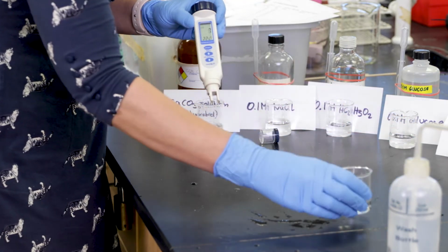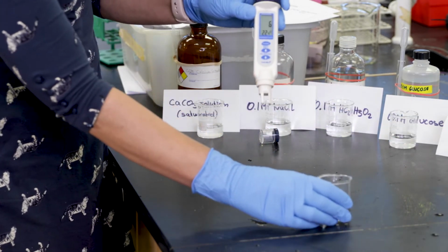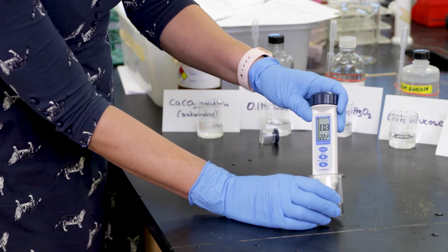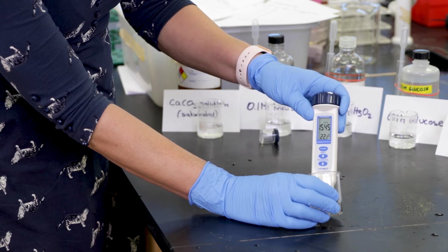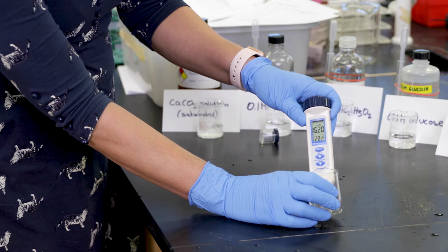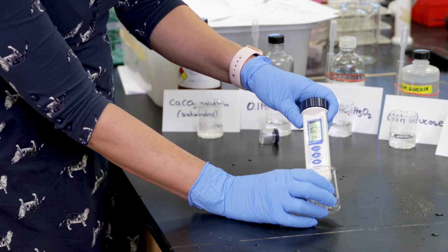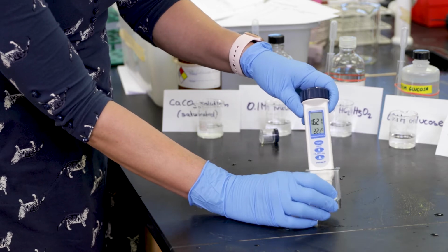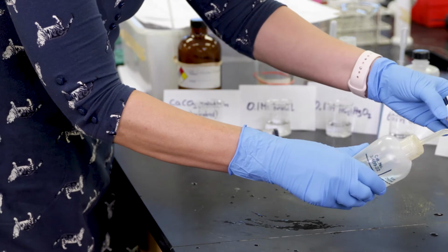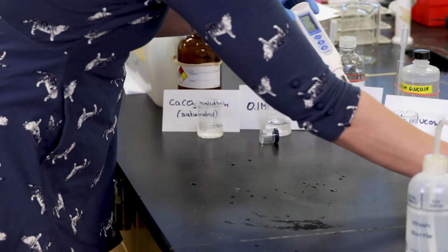Next, we want to measure the conductivity of magnesium chloride. The magnesium chloride solution, let's dip that in here, wait a little bit until it stabilizes. What we read here is actually 16.2 millisiemens. And last but not least, I took sodium hydroxide.